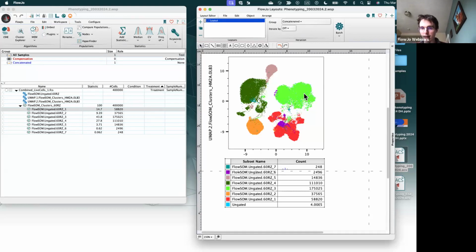We also see some pretty big clusters down here that might have multiple subpopulations within them. And down here, there's kind of a curious thing because this is a separate cluster, even though on the UMAP, they're very much together on this island. And there's a couple maybe outliers or different phenotypes here that it was maybe struggling to place or put close to this island as well.